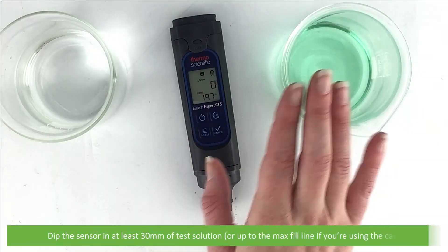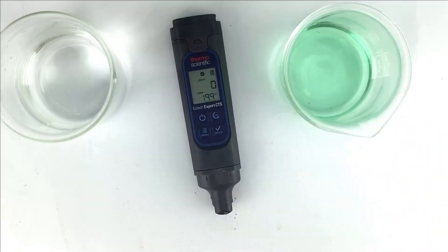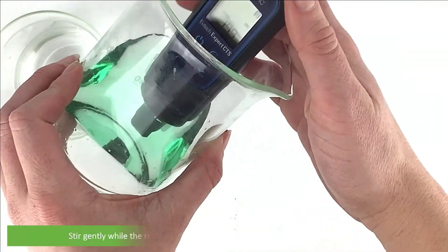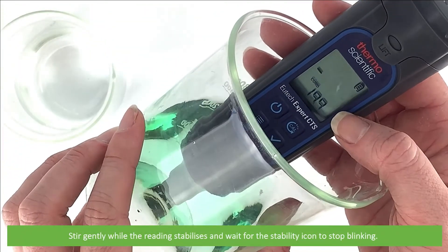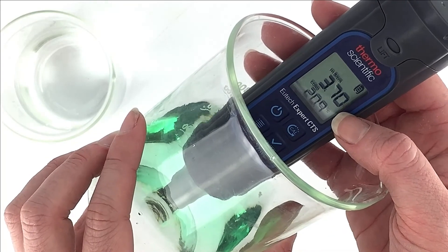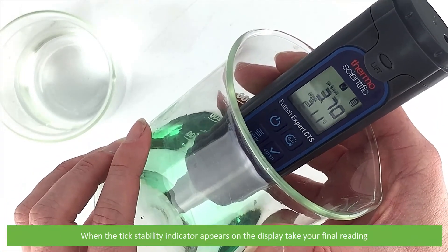Dip the sensor in at least 30 millimetres of test solution, or up to the max fill line if you're using the cap. Stir gently while the reading stabilizes and wait for the icons to stop blinking. When the tick stability indicator appears on the LCD, take your final reading.